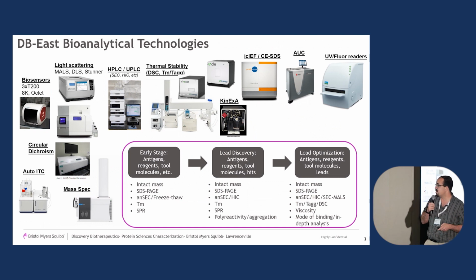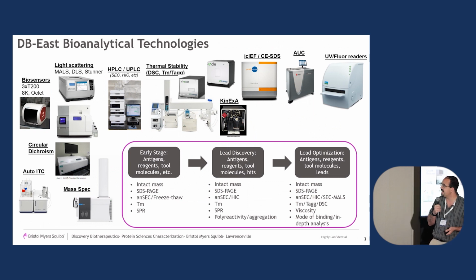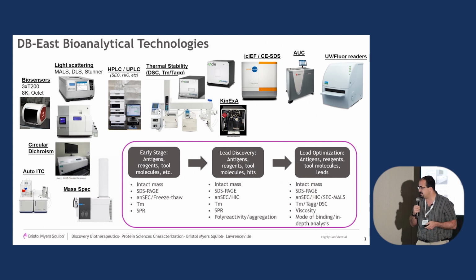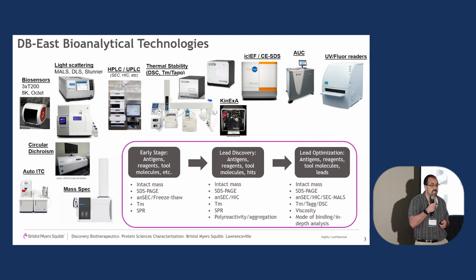Once we get to the lead discovery stage, we're still looking at antigens, reagents, tool molecules, and hits. We're using a lot of the same type of instrumentation, but we're adding in polyreactivity and aggregation studies to study early developability and aggregation assessment.